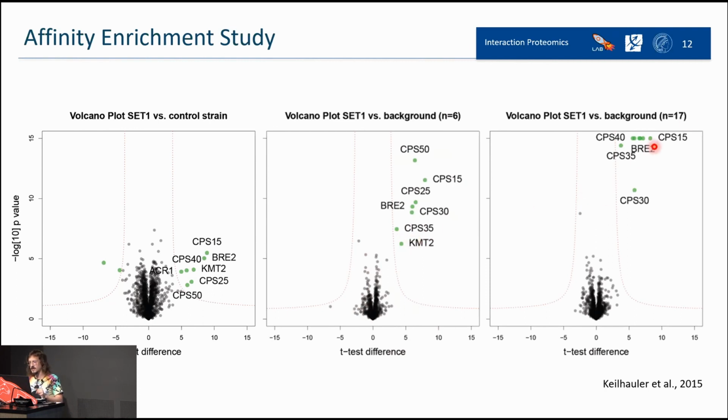And then lastly, they went up to even 17 other experiments, like the entire data set they used. And we can see here that the p-value is so low now that the volcano plot is too small to show where they're actually supposed to be.